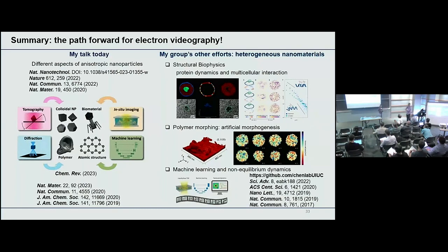So that's always a challenge out there. If the system becomes more complicated, the free energy landscape will become more complicated. In those cases, one possibility would be to utilize these in situ modules to actually do some annealing of the process. For example, we can heat it up a little bit. That might be helpful. And right now, the heating temperature range is from room temperature to 200 degrees C. So it's actually pretty powerful.